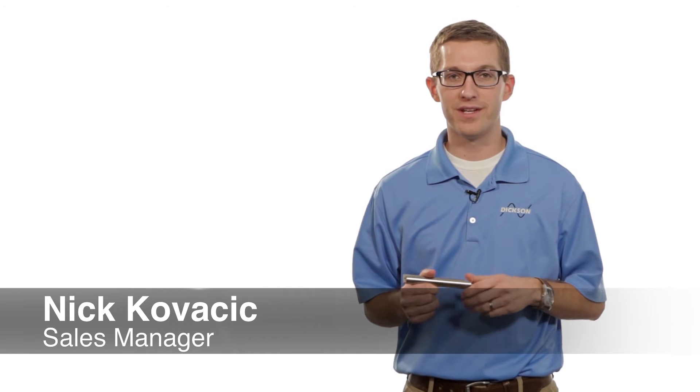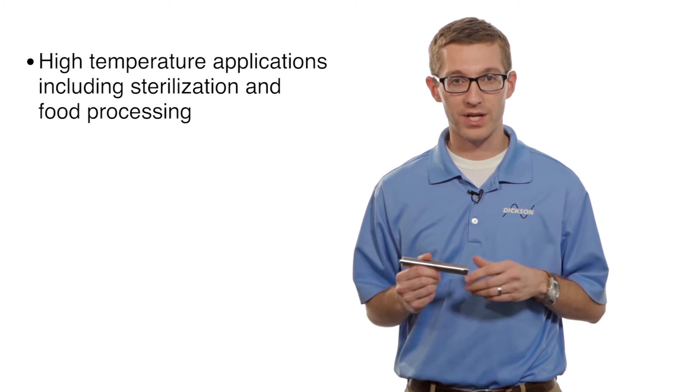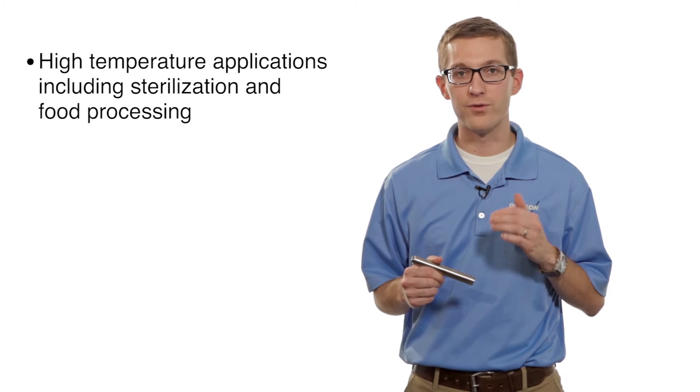Hi, my name is Nick. I'm with the Dickson Company. Today we're going to be talking about our HT200, which is our high temperature data logger. This unit is great for use in a lot of high temperature applications like sterilization or food processing.